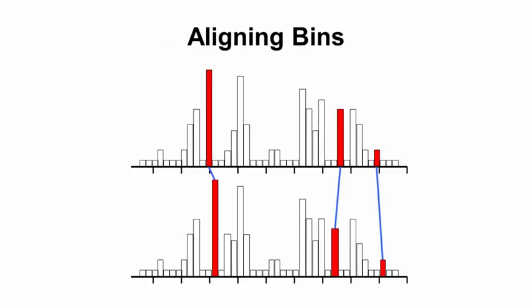And then we can do something that's relatively easy. We're looking for the bins that should be aligned, where they're different. And if you compare these blocks or bins or rectangles, you can say for the most part they match, but what I've marked in red are bins that don't match. And so all we have to do is shift the bins left or right so that they do match.